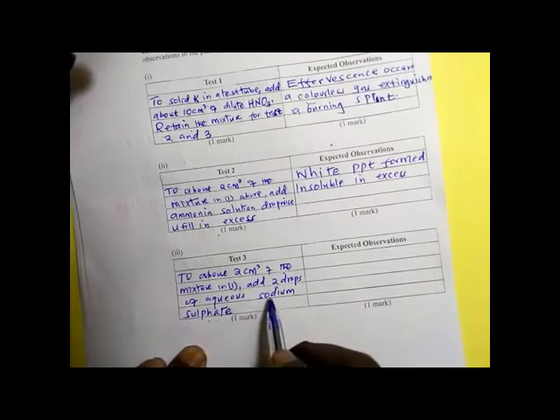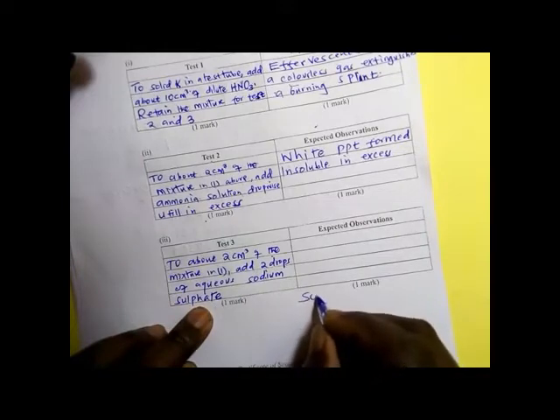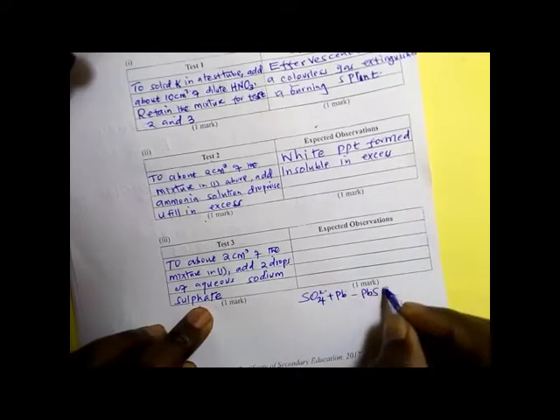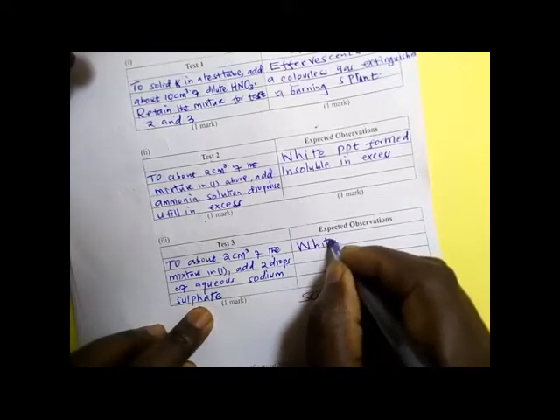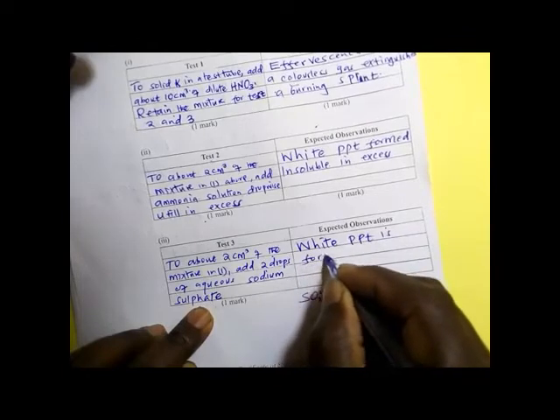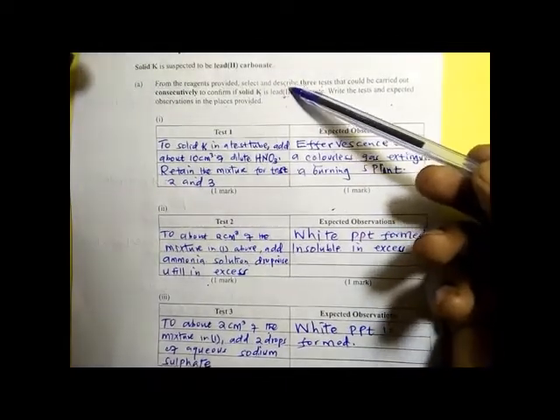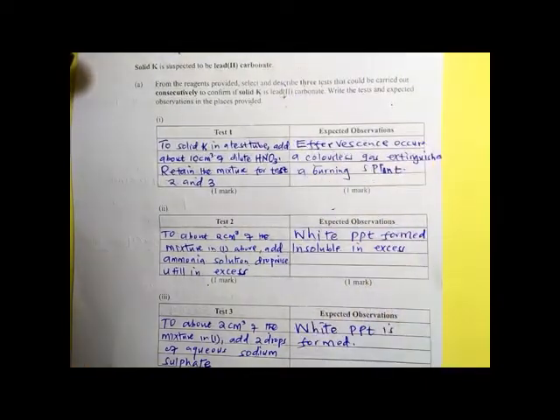We are adding sodium sulfate. We expect that the sulfate will combine with lead to form lead sulfate. Therefore, here you are expected to write a white precipitate. White PPT is formed. Now, up to that point, you have confirmed that this one could actually be lead carbonate.